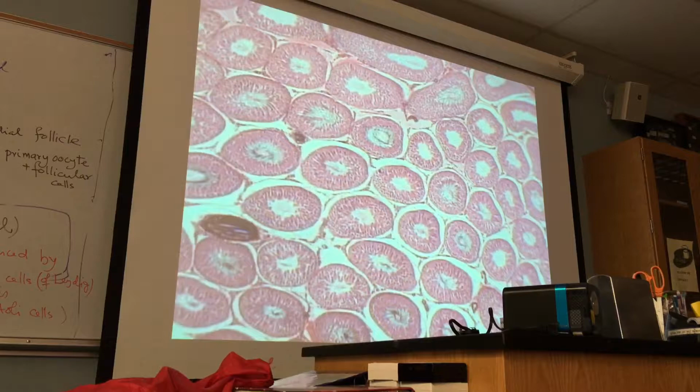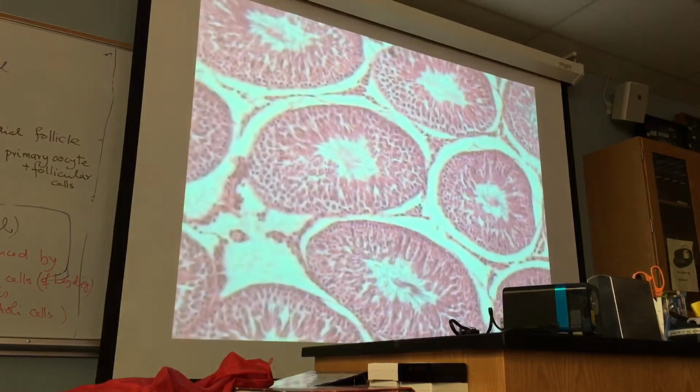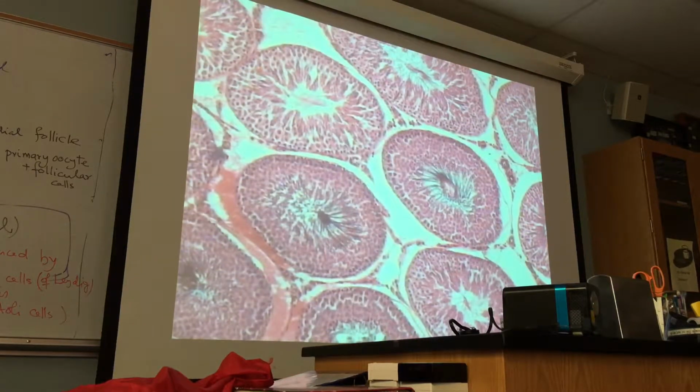Okay, let us go to higher magnification to look at the spermatogenic cells. Beautiful. The row of cells next to the basement membrane.